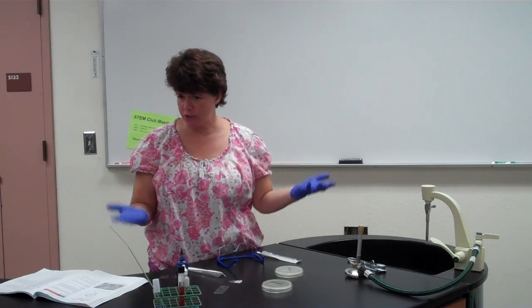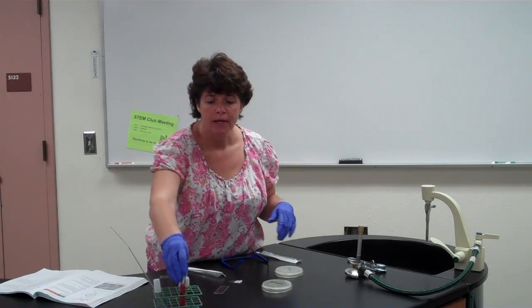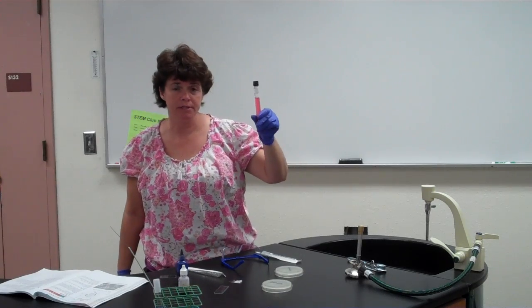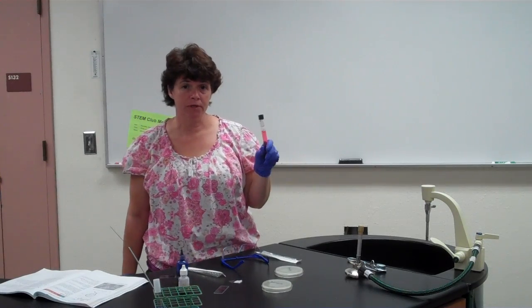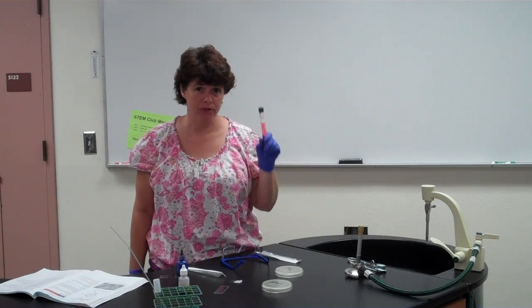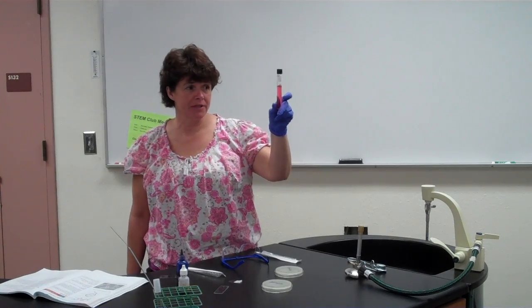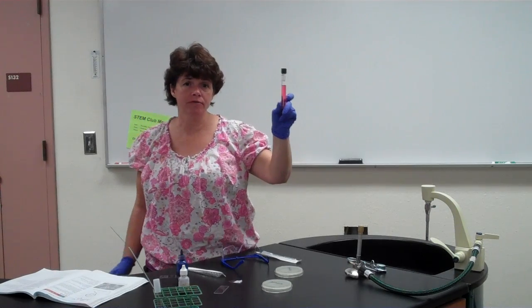I'm not going to demonstrate the whole thing again, you've done this before. Now I have here a red fermentation tube like we've used before, but in this particular lab, we're going to be using a different indicator which is called bromocresol purple. So instead of being red, it will be purple. And it still has the Durham tube in it to look for the presence of gas.